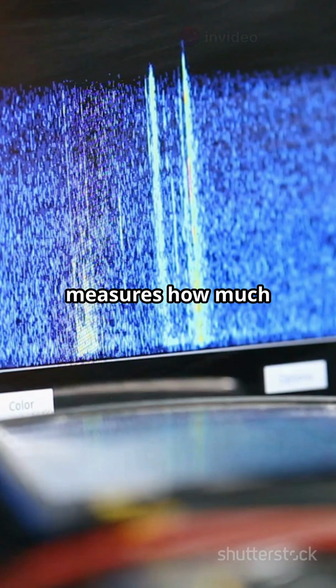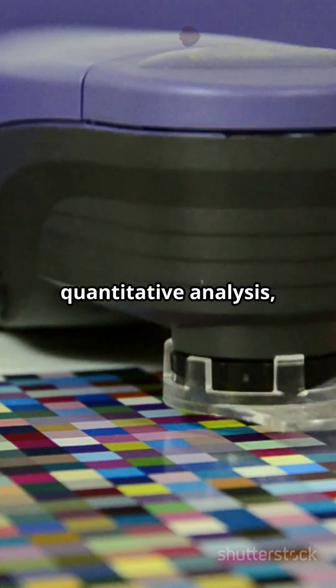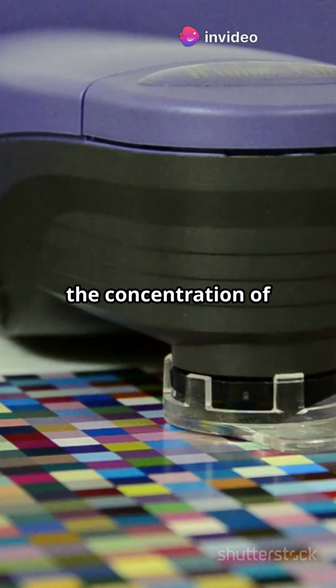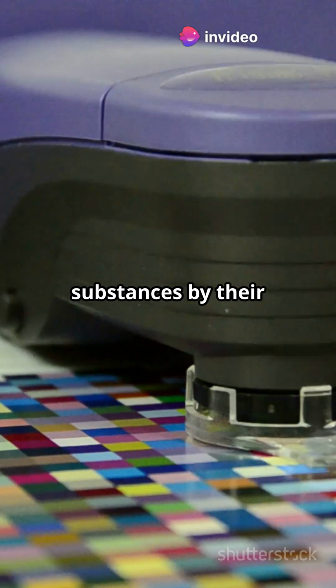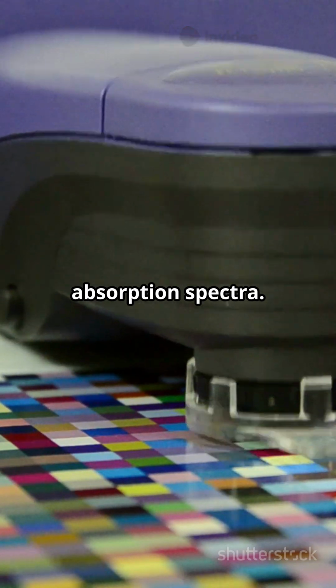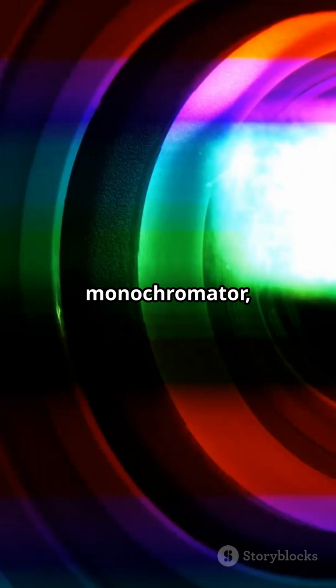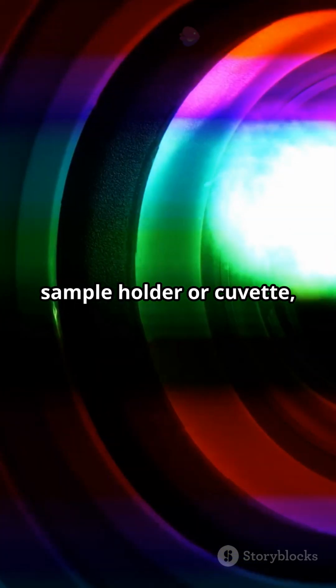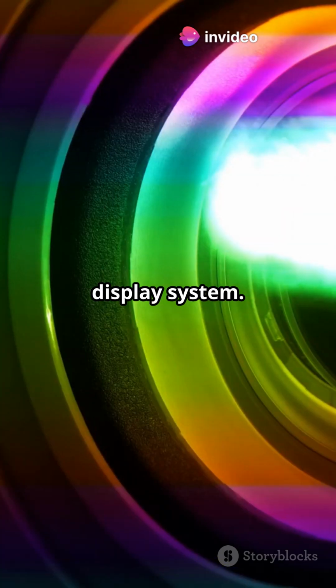The instrument measures how much light is absorbed or transmitted at specific wavelengths. This allows for quantitative analysis, such as determining the concentration of a solute, or qualitative analysis, like identifying substances by their absorption spectra. The main parts of a spectrophotometer include the light source, monochromator, sample holder or cuvette, detector, collimating optics, and the readout or display system.